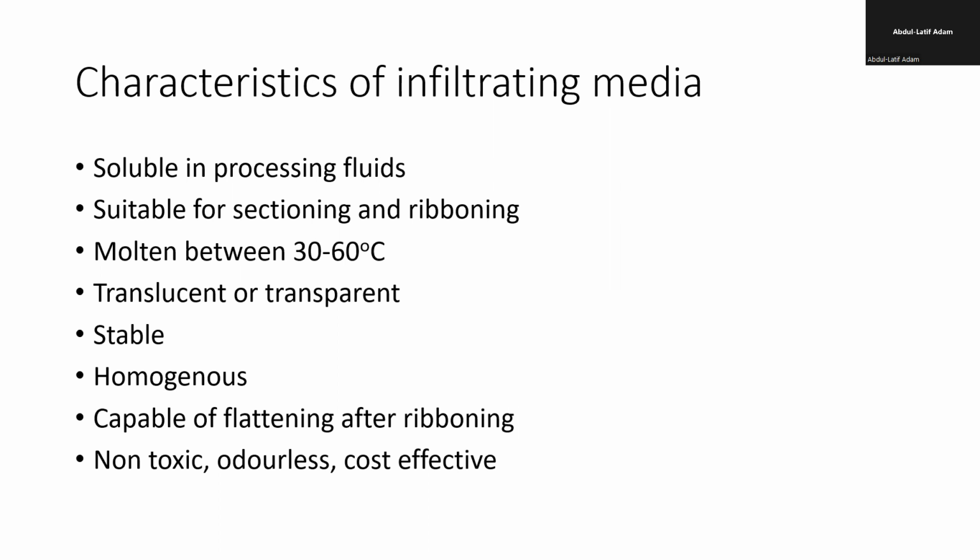Okay, so you should be able to do that. And the medium itself should be able to be seen through, not very seen through, but it should be clear enough so that if there is anything that is not supposed to be in there, you'll be able to identify.